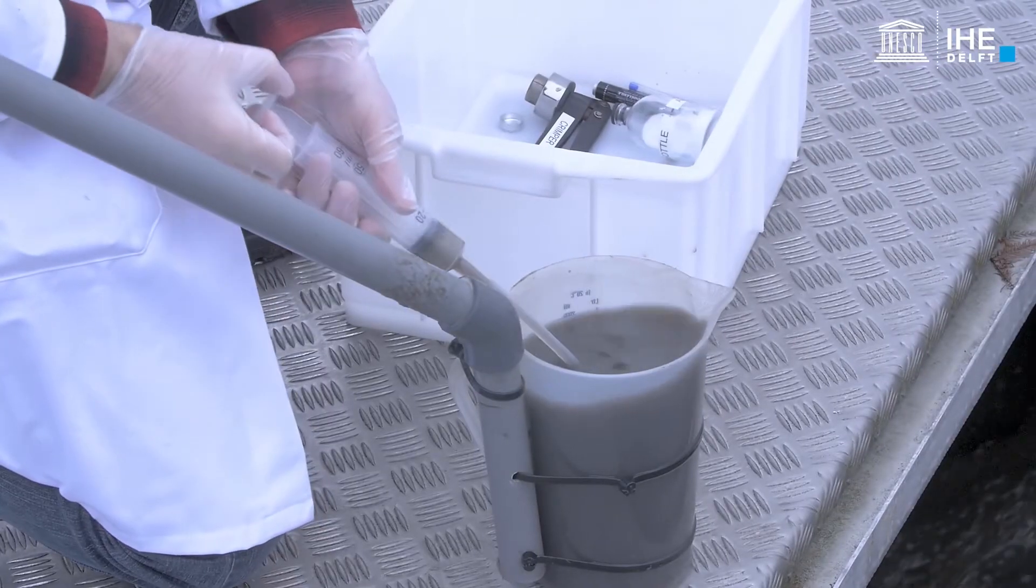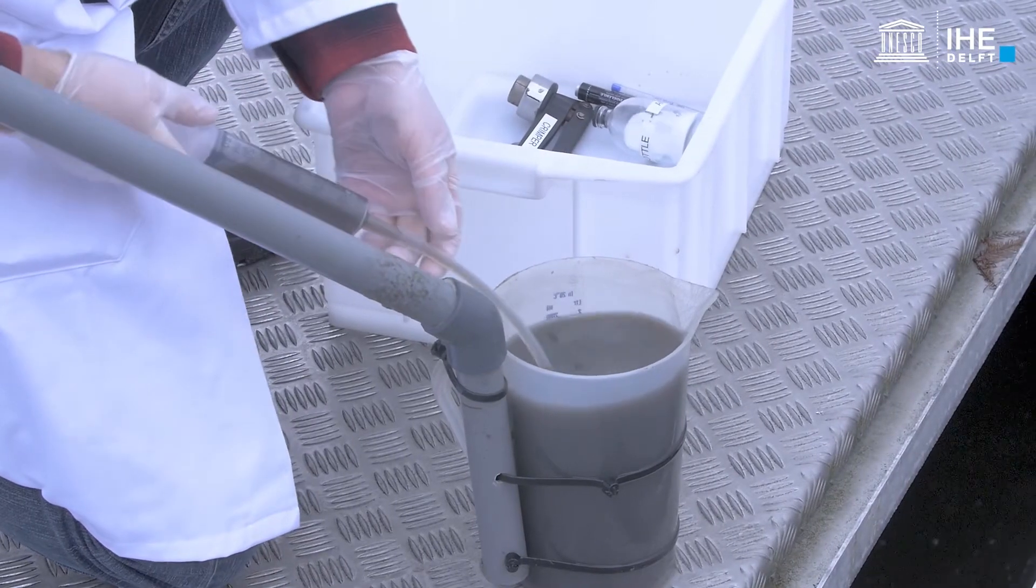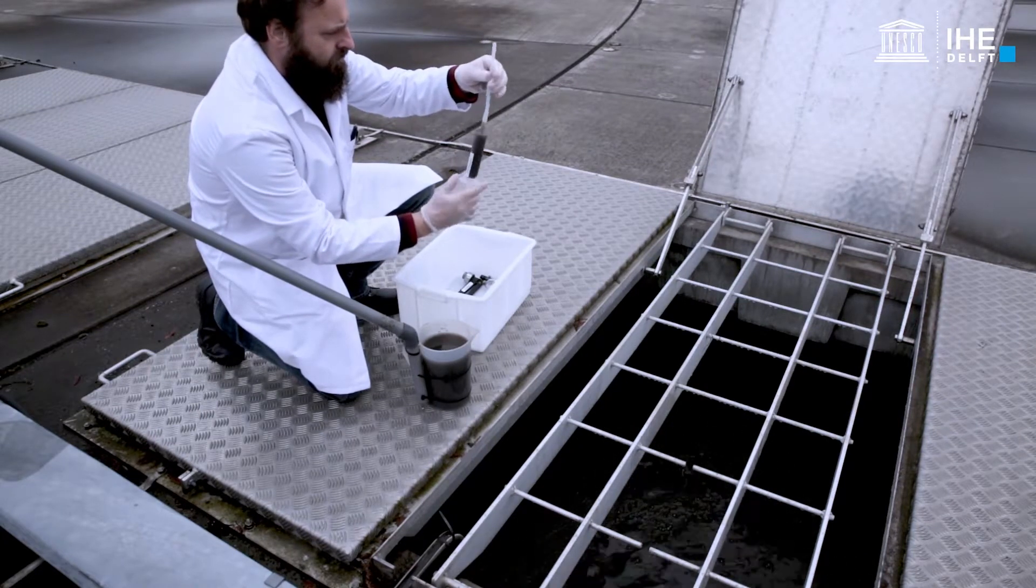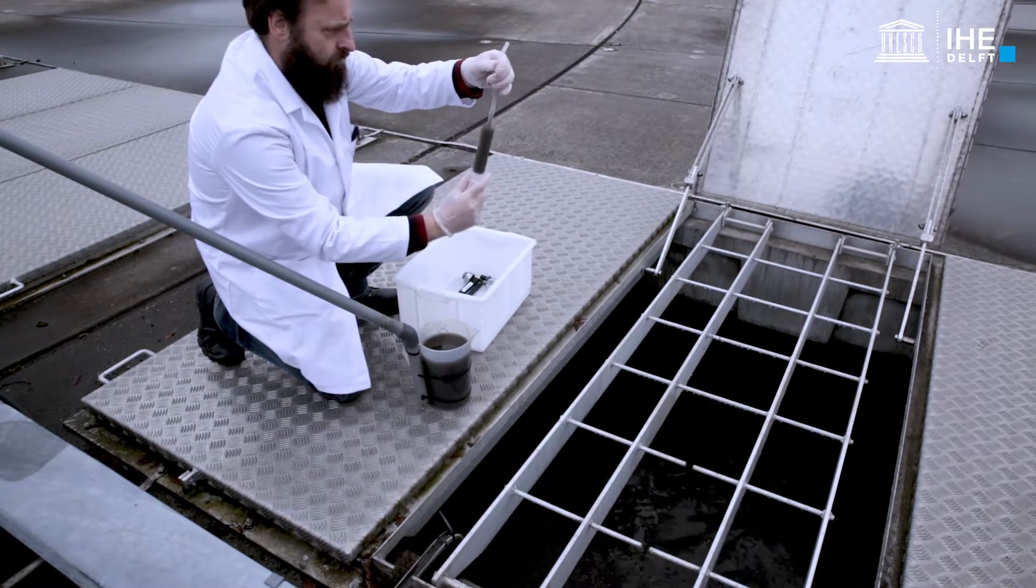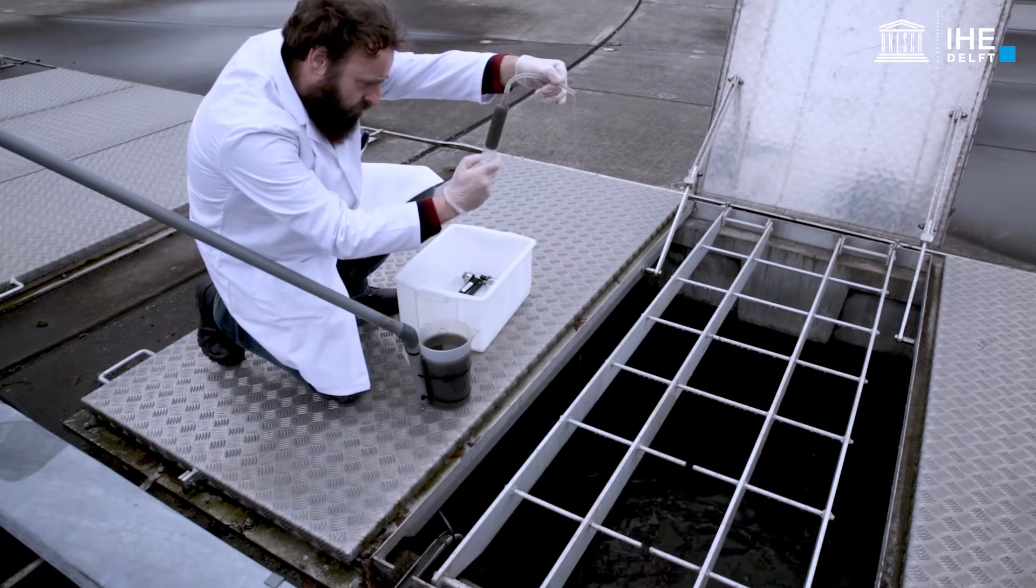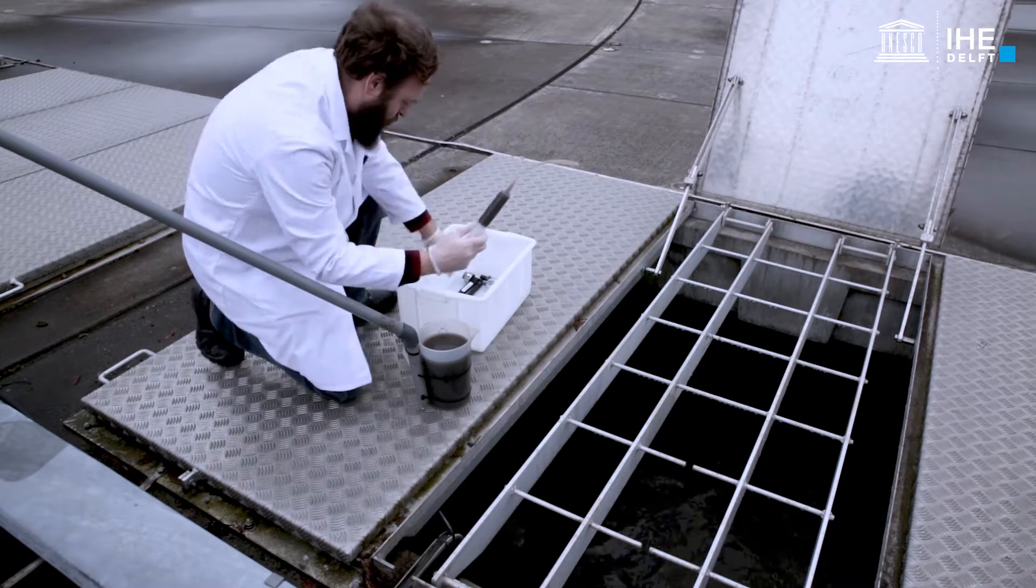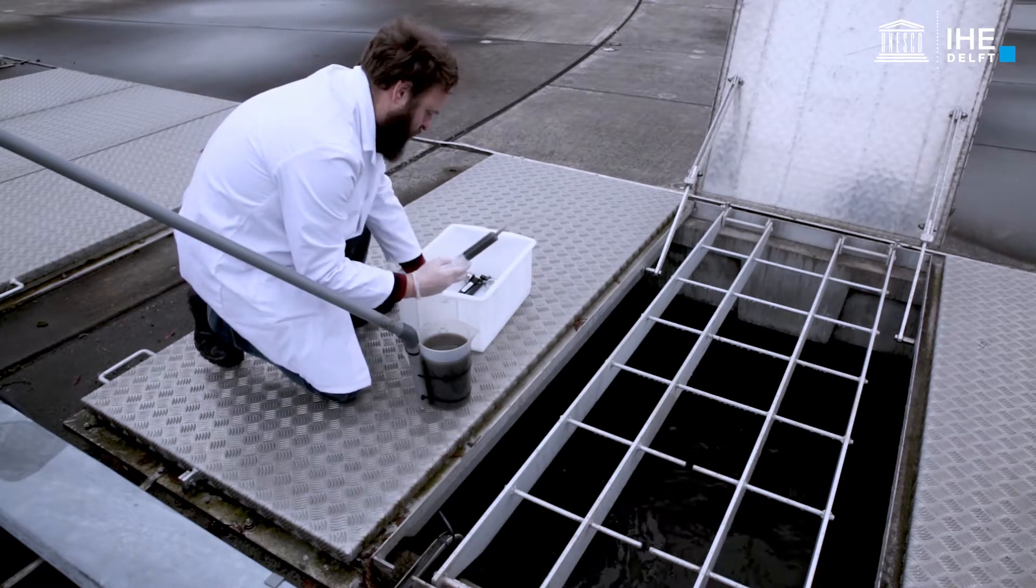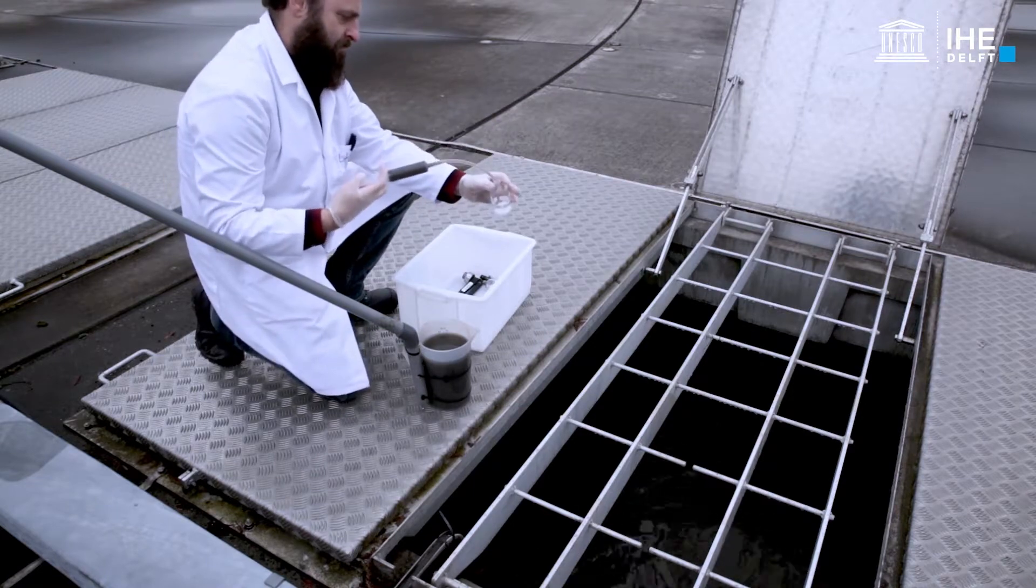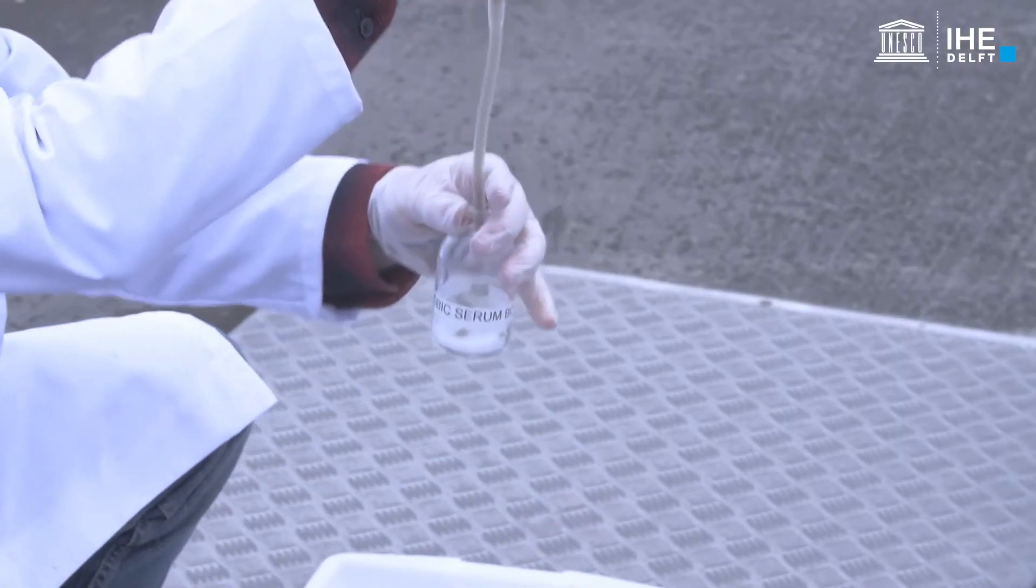Using a syringe with a catheter tip and a 10cm silicon tube, 50ml of sample is added carefully to the serum bottle filled with salt. To avoid the stripping of the gases, the silicon tube should be held under the rising liquid surface when pouring the wastewater sample into the bottle, in order to keep the liquid gas interface as small as possible.